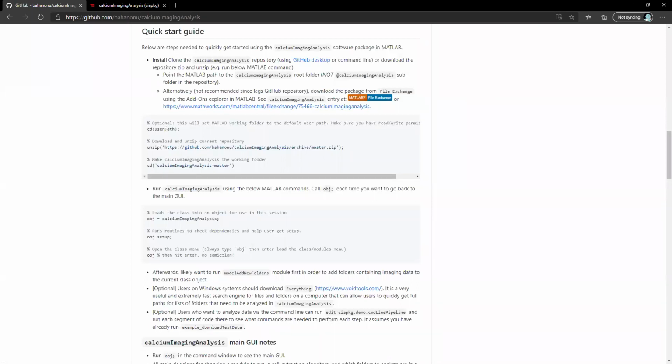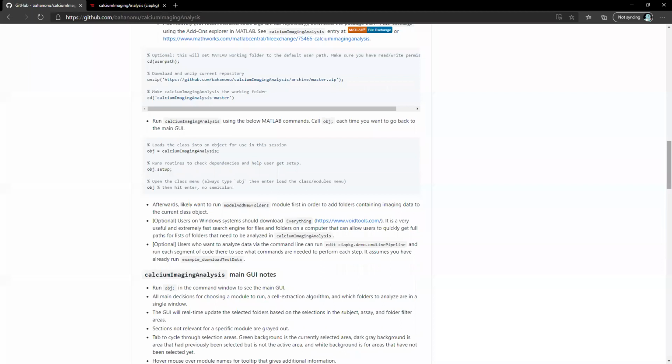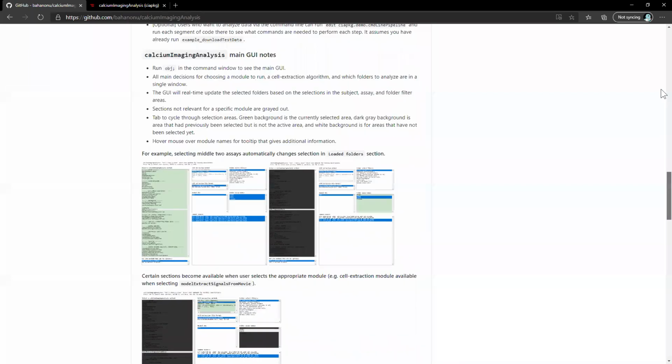But it's really easy to actually just load in, say, a package purely from the command line without having to go and do the download from the GitHub. So if you just run this command and then run these commands, you'll be set up. And I'll show you that today. And then it contains some additional notes on here, but this is a summary section.